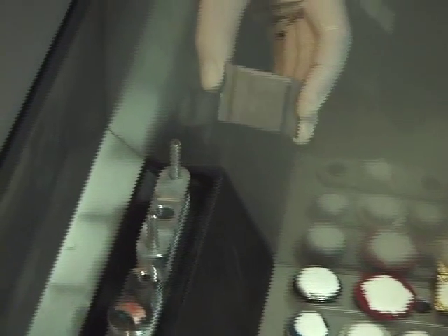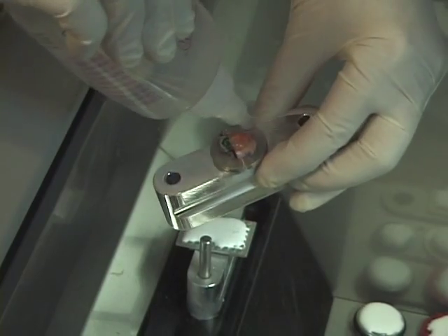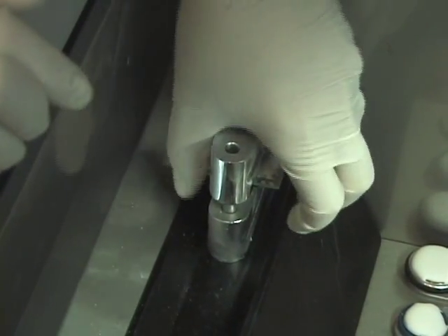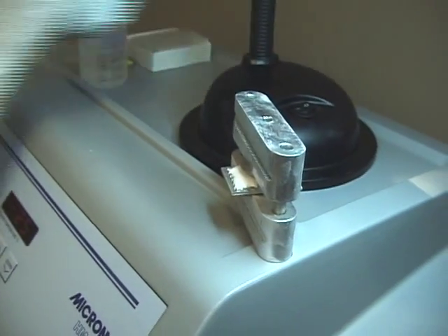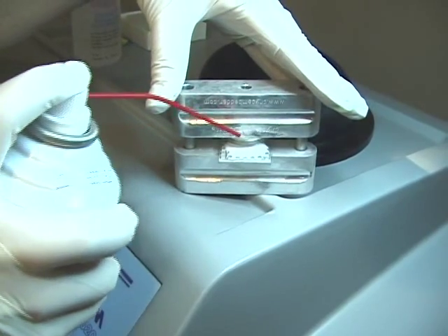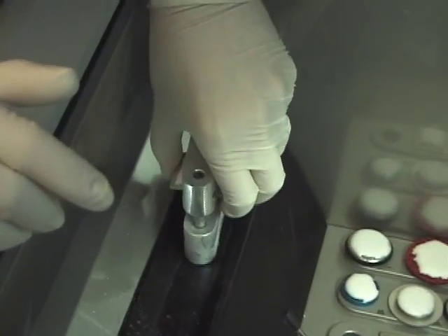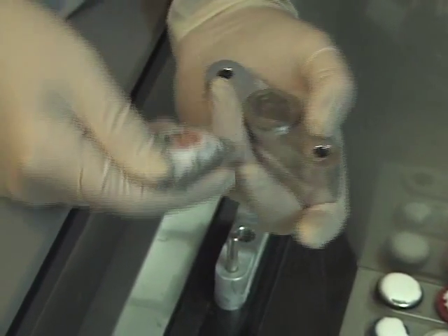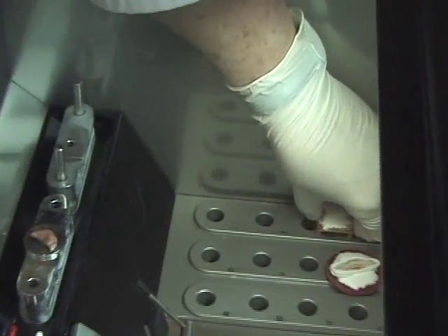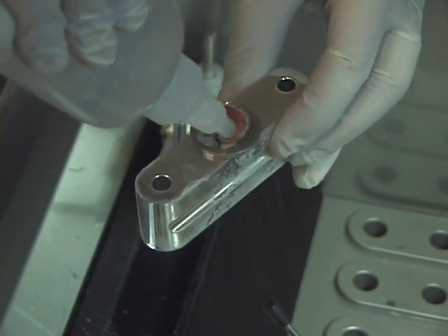When the discs are separated, the tissue has been transferred to the cutting chuck — perfect. Here is the process shown again with the square Shandon chuck. Companies often merge or change names; if the chuck you use is similar to any of these shown, they will work with the cryoembedder. One great advantage is the ability to remove it from the cryostat chamber, which assists with visually witnessing the flatness of the specimen and being able to spray without stirring up harmful airborne pathogens. The chuck holder on the Tissue Tech cryostat is unable to adjust for variation from specimen to specimen, but with the cryoembedder, each specimen is lowered onto the posts in the same alignment, eliminating the need to make adjustments.